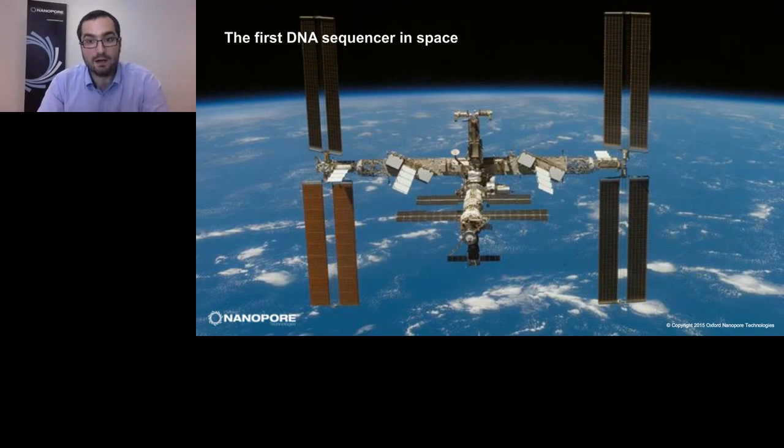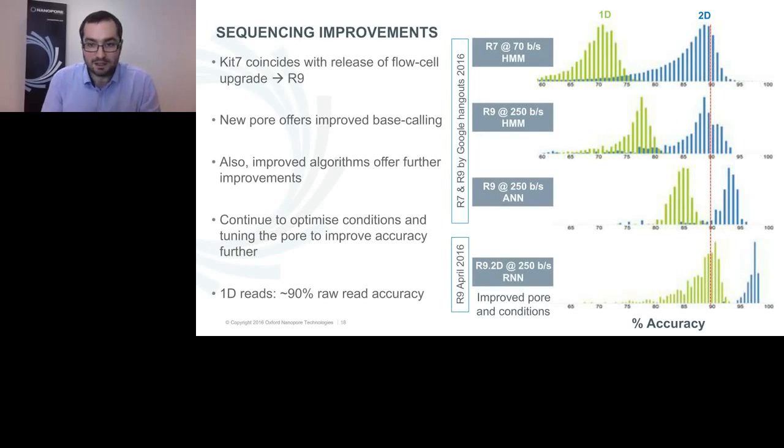You would still get a partial 1D read, a bit shorter than the fragment length you could potentially have had. But because of the improvements in sequencing chemistry, the 1D reads now are pretty good, so the data from that truncated 1D read would still be useful. But nicks would lead to premature termination and loss of data.